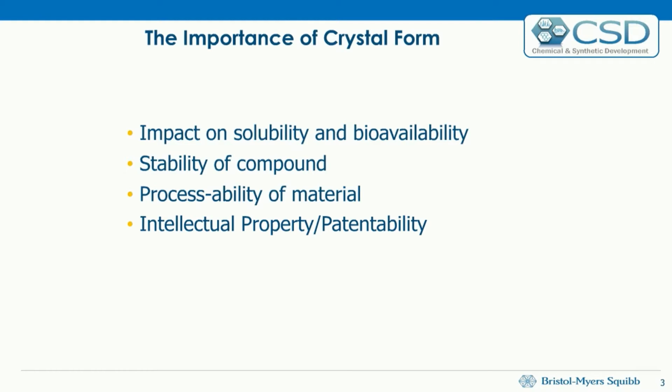Why is crystal form so important? If you think about it, the main driver is its impact on solubility and bioavailability. Having the right crystal form is critical towards bioavailability. So we have to have total control of the crystal form once we make it and get it ready for marketing. Stability is obviously another important factor. You want the most stable crystal form possible, simply because it's going to have to be transported, milled, moved around, exposed, etc., in bottles, and so on.